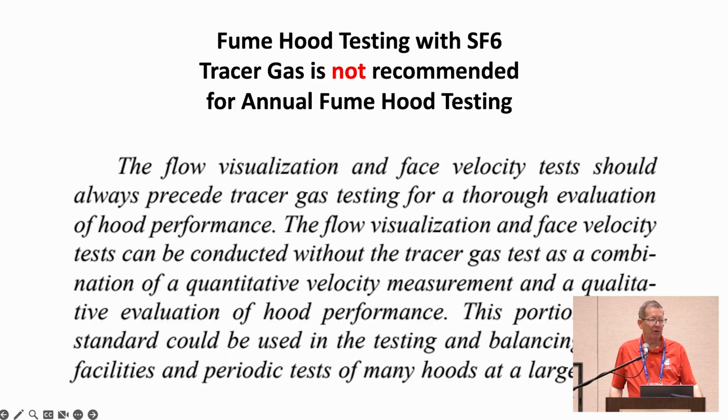It should be used at the factory to develop new hoods and by users to troubleshoot hoods that are hard to understand. But just to look at a hood that's working normally, just use the first three parts: face velocity, small scale visualization, and large scale visualization. There, I saved some of you a lot of work.